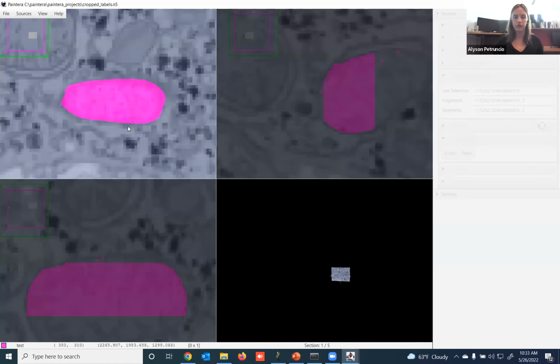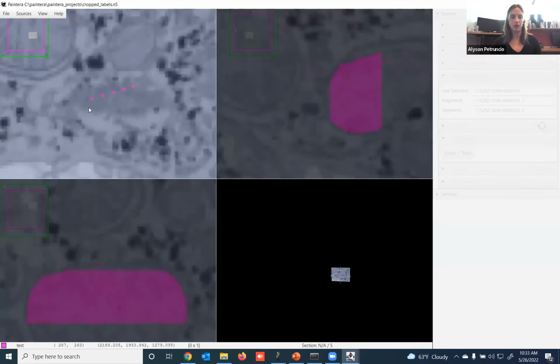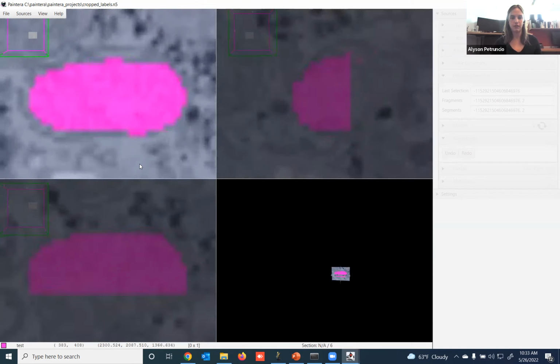There is no flood fill feature in shape interpolation mode, but there are workarounds that are actually much more efficient than flood fill that I will talk about in a second.